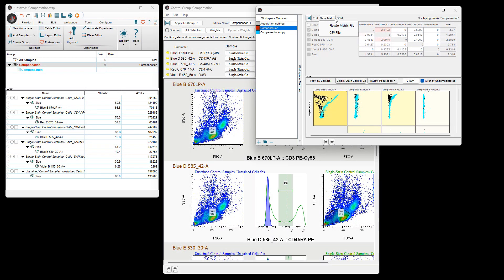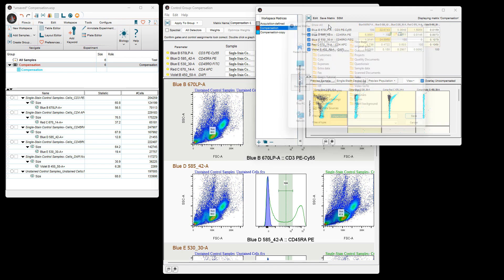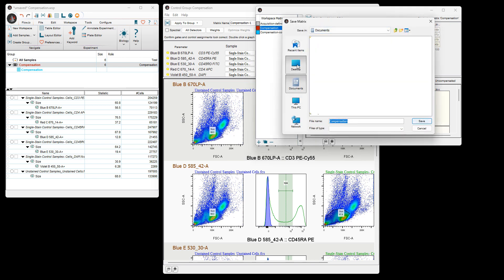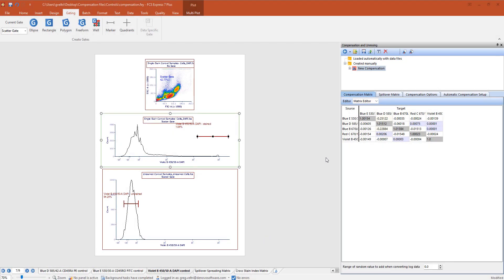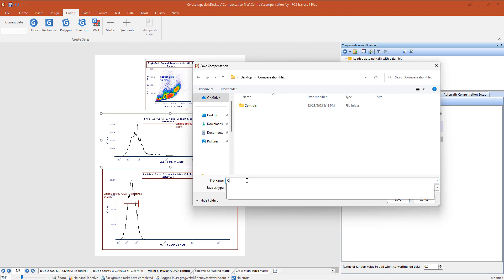In FlowJo, saving the compensation matrix to use with experiments is done by selecting the Save Matrix button and choosing to save as a FlowJo matrix file. Choose a name for the matrix file and click Save. In FCS Express, navigate to the disk icon in the Compensation and Unmixing navigator, enter a file name, and click Save.